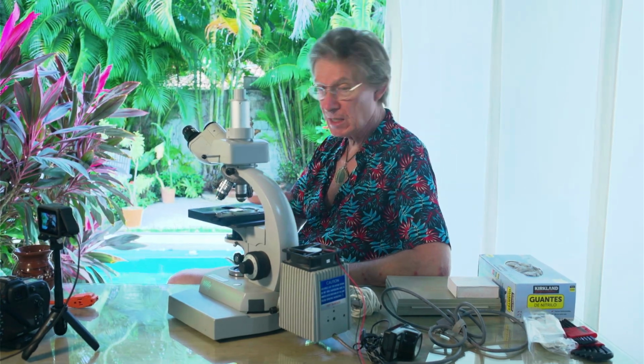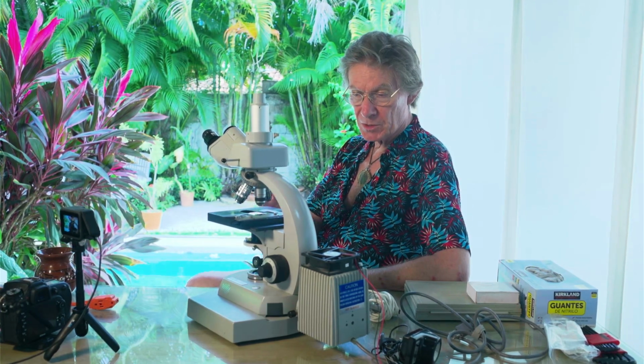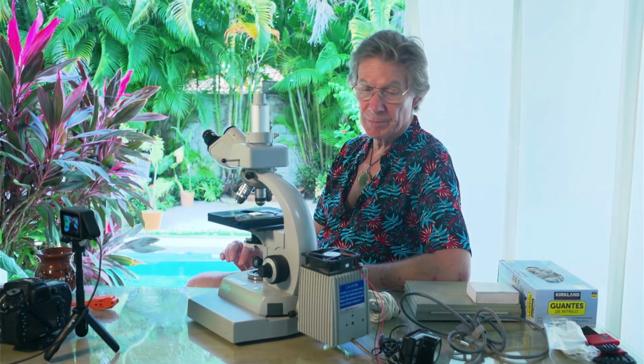Now, it can be a speck of dust. It can be an energetic artifact caused by static electricity or even by magnetic fields, which might be produced by things like light sources and power supplies that are in the vicinity, or a Wi-Fi router that's in the vicinity of the microscope and the sample being examined.